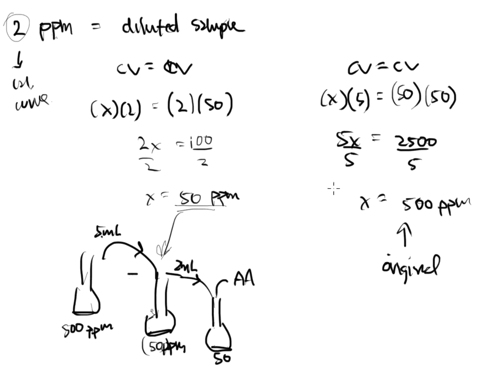All right, well, when I do that, this part per million is going to be based on milligrams per liter. And there's a couple of ways that we can continue with the math here. I'm going to explain maybe both of them and show you which way I would prefer your spreadsheet to be set up as. So let's say that we have a 500 part per million solution calculated as our original. That means there's 500 milligrams for every liter of stuff.